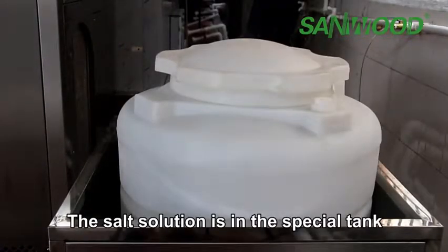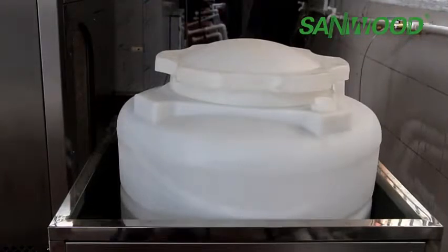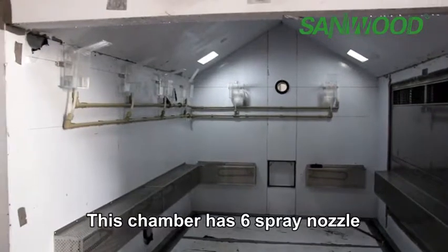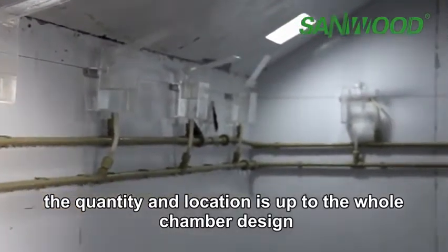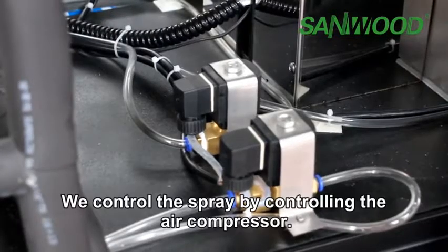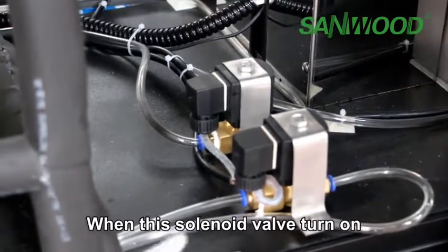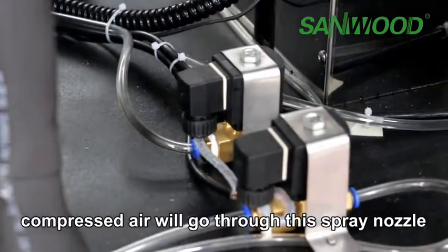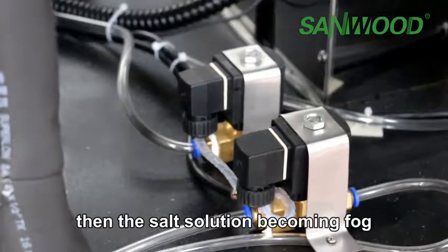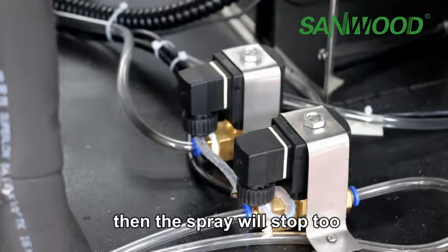The salt solution is in a special tank which is installed on the side. This chamber has six spray nozzles — the quantity and location depend on the chamber design. We control the spray by controlling the air compressor. When the solenoid valve turns on, compressed air will go through the spray nozzle and the salt solution becomes a fog. When the solenoid valve turns off, it cuts the air and the spray stops.